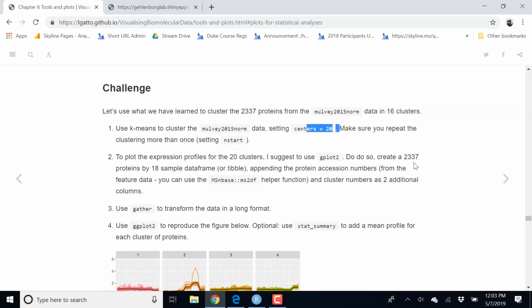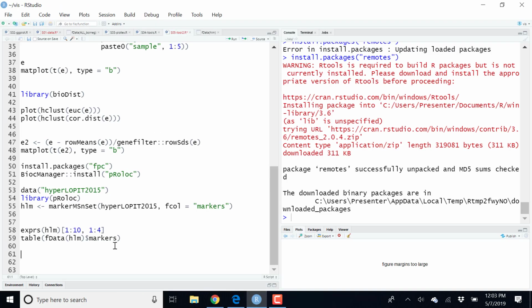analysis. So here are the set of steps that you might want to do. The data isn't in the set, but to produce this figure, I think I forgot to mention something here. One important piece of information that you need.